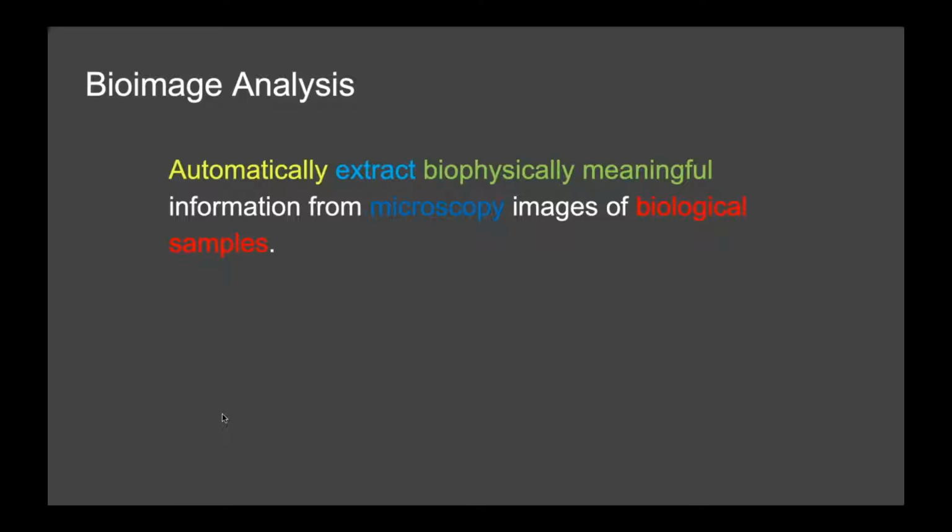And last but not least, these are biological samples. So to properly do the job, you also really have to have a good deal of knowledge about biology. Since all of this is quite demanding, there is now a new profession emerging of people that are just doing this, and they do it in high quality. These people now call themselves bioimage analysts, and I would call myself like that as well.